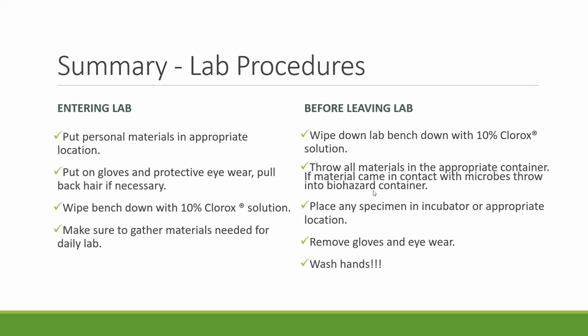Then after the instructions come from the faculty member, you're going to grab your materials for the day and begin your lab procedures. After you've completed your lab procedures, you have to get ready to leave the lab, and there's also a process. Before leaving the lab, while you're still gloved up, you're going to do it in reverse order. So you're going to wipe down your lab bench with a 10% Clorox solution again.